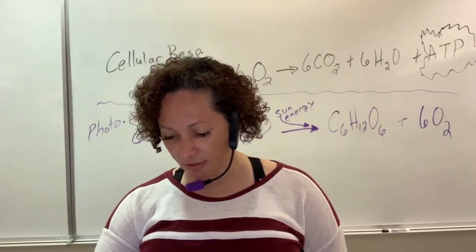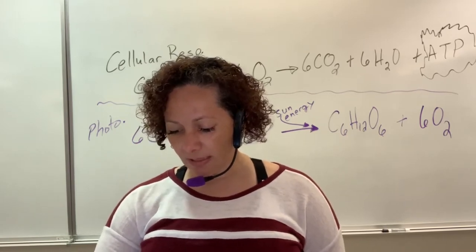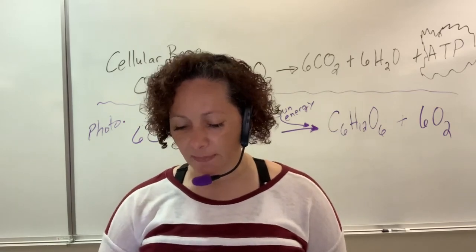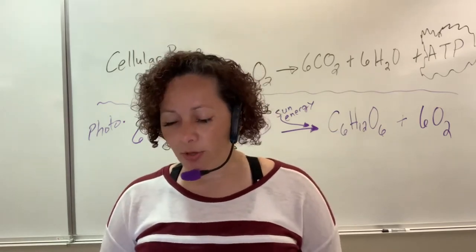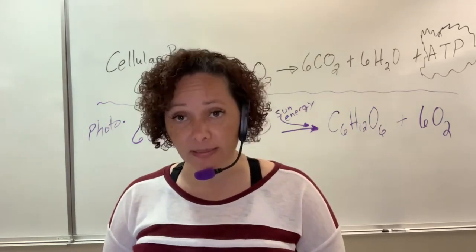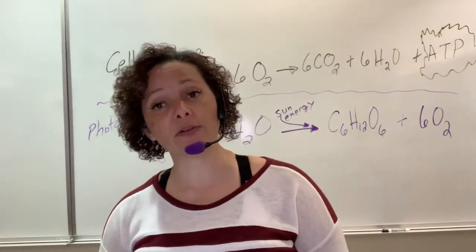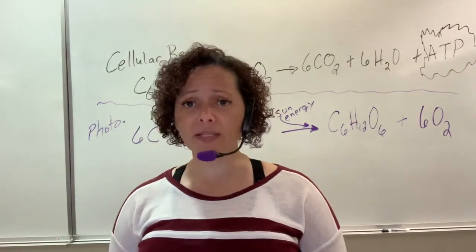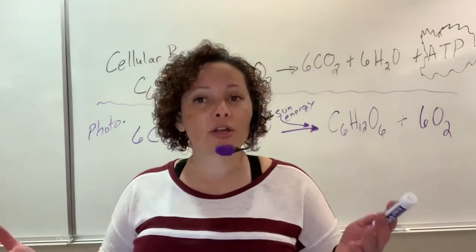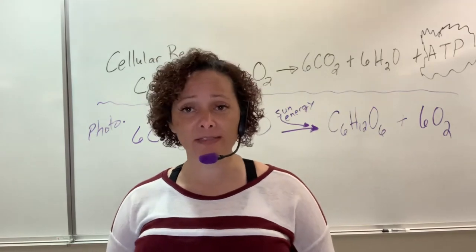Before you get started, I have gone through past figure 4. What we're going to be reading, just go ahead and pass your figure 4 in photosynthesis. It's before you state your hypothesis, okay? We are going to be trying to figure out the respiration rate of our organisms, okay? So we're going to do some animal organisms and we're going to do some plant organisms. Like I told you, depending on the campus, depending on the availability, you don't know what they're going to be yet. So I've already given you a couple of the animal organism examples.